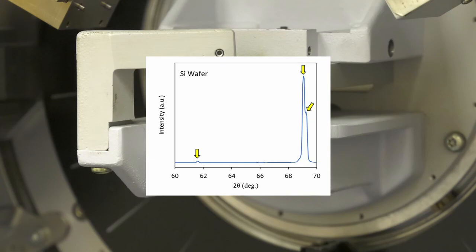A closer look at the main diffraction peak of the single crystal silicon wafer reveals that it is actually two peaks, and a smaller peak is also apparent. What explanation can be given for the appearance of these extra peaks?